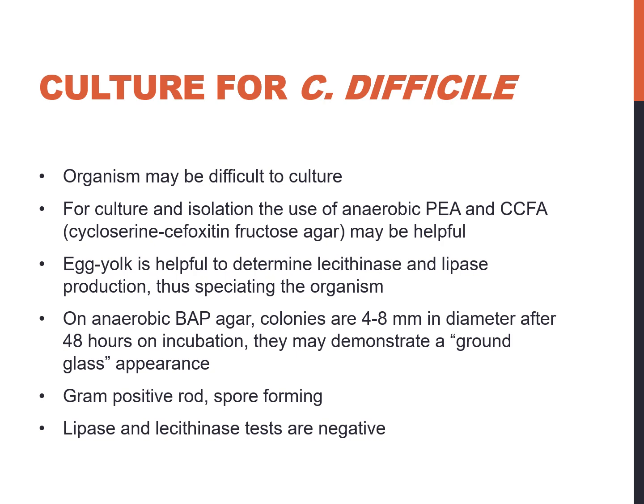And we're also going to set up a selective and differential media known as CCFA, or cycloserine cefoxitin fructose agar. That is selective for Clostridioides difficile. We can also set up an egg yolk agar. Egg yolk agar will help us determine if our organism produces lecithinase or lipase enzymes.